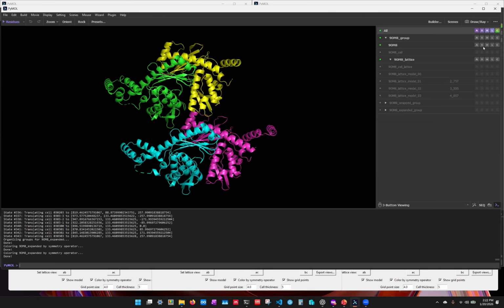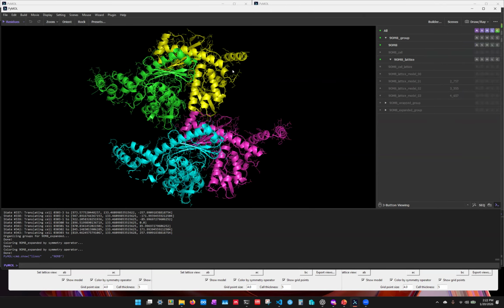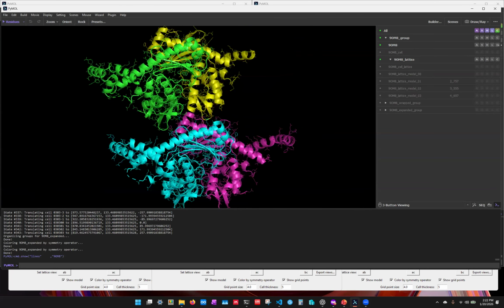And you might also know that the structure that you downloaded from the PDB is really just the XYZ positions of every single atom in that protein. So we could look at that, show as lines. And so you can see every line is just an individual atom.